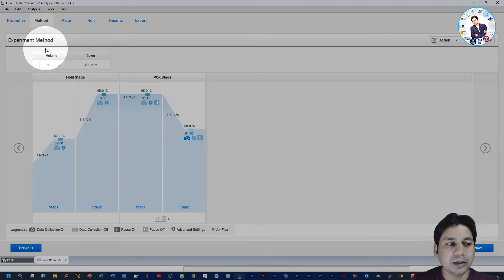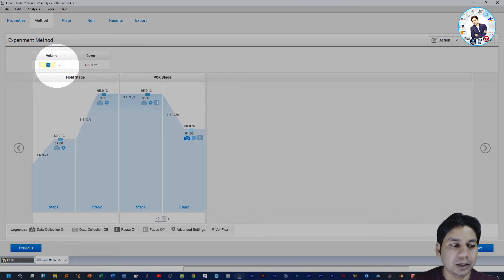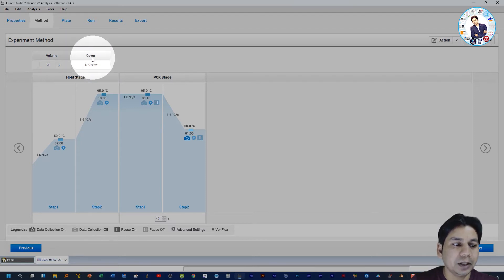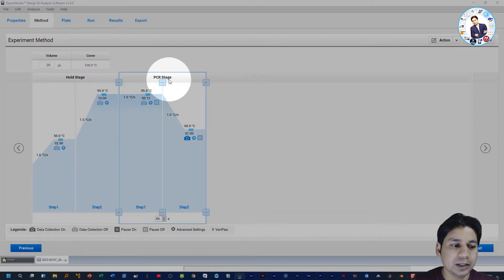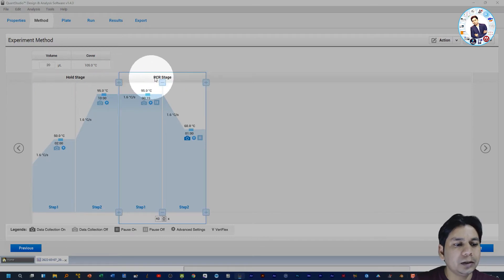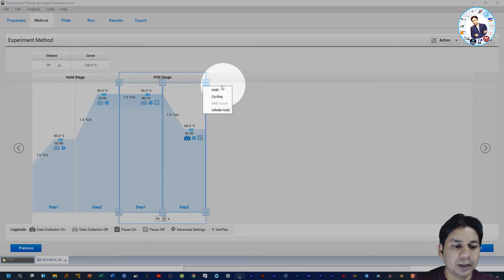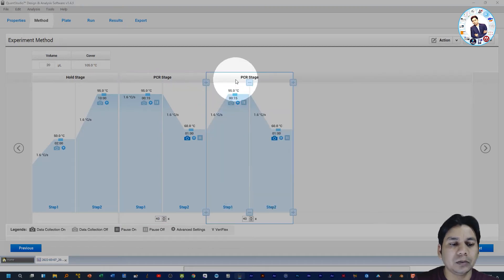Clicking Next brings you to the Experiment Method section. First is the reaction volume — I am selecting 20 microliters; by default it is 50 microliters. Leave the cover temperature as is. Here you can see the stages of the PCR cycle: the Hold Stage and the PCR Stage. If you want to add one more stage, click the plus button and select Hold or Cycling — you can see a new stage is added.